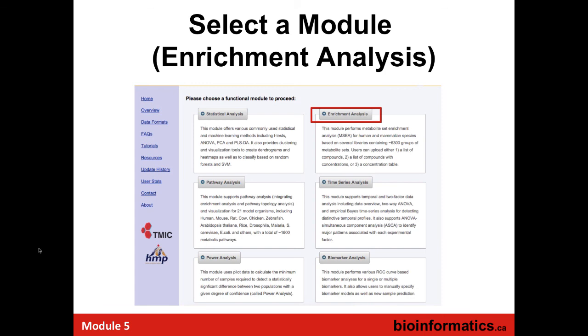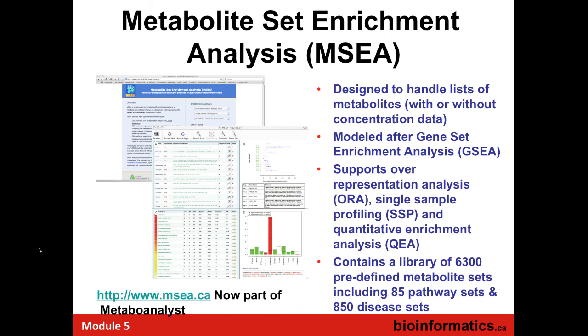So that's statistics. That's where 90% of the activity of MetaboAnalyst is. But probably the most useful stuff is in the other 10%. This is because I think people are so obsessed with PLSDA and PCA. One of the real gems of MetaboAnalyst is this tool called enrichment analysis. This is a concept that Jeff developed from gene set enrichment analysis, which is well known. We were trying to come up with a name for it, and we just call it metabolite set enrichment analysis. So it's sort of gotten a life of its own.